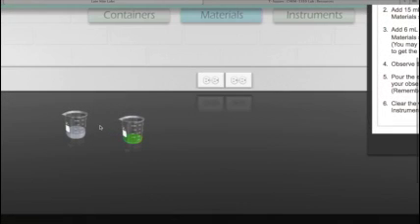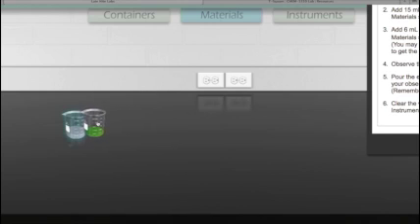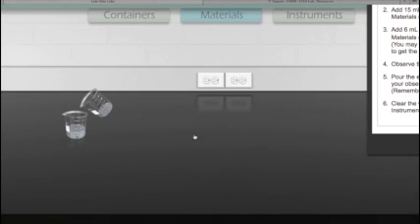No reactions seem to take place. We're just pouring the solutions in. But now we're going to add the beakers together to see if anything happens. You hit pour all in Late Night Labs to add the complete contents of a beaker into the other.